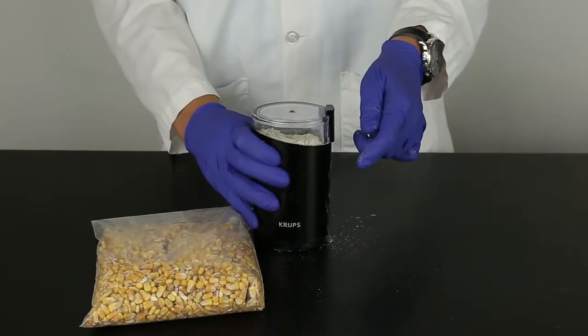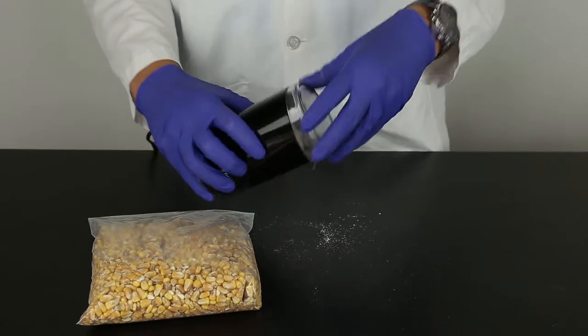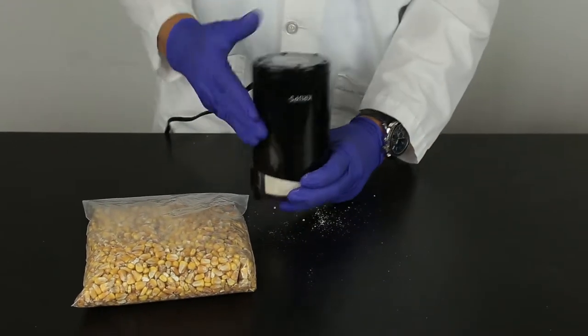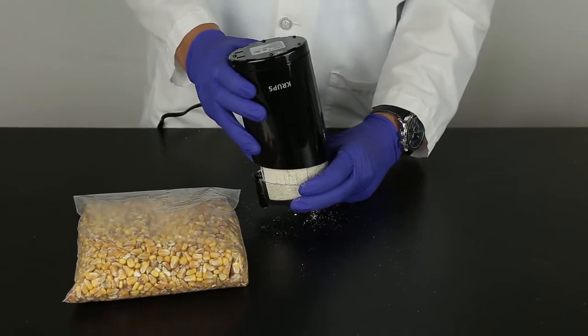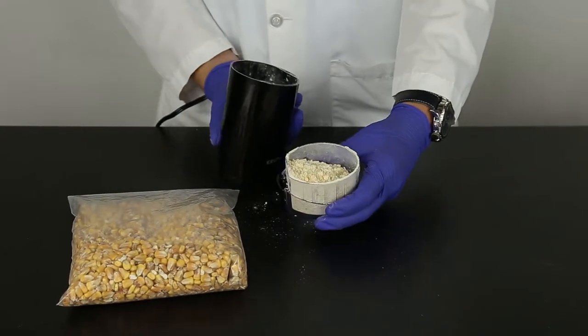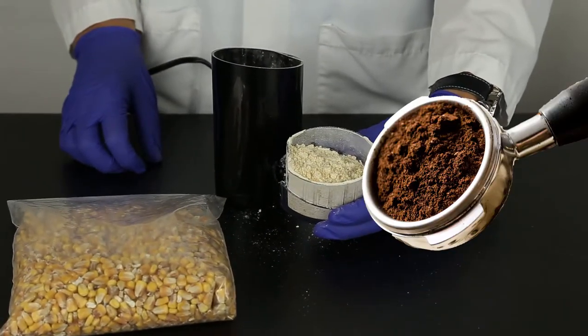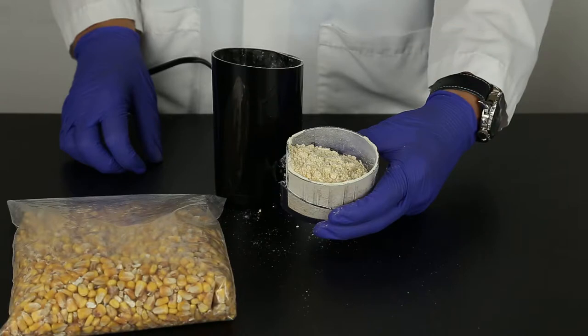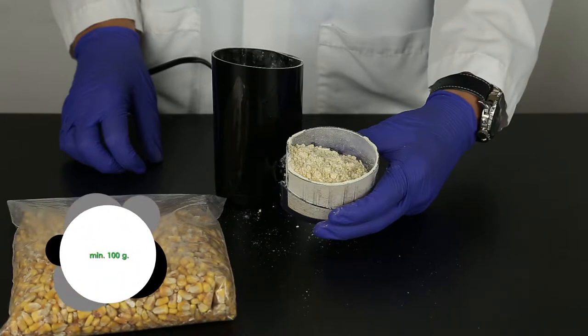Obtain a representative sample and grind so that at least 95% of the ground material passes through a 20 mesh sieve. The particle size should be about the same as espresso. It is best to grind a minimum of 100 grams of your sample.